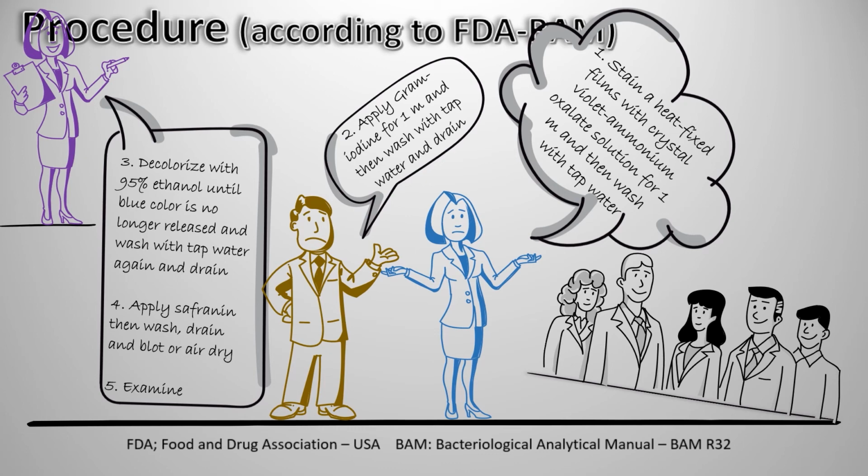And after that, just decolorize with 95% ethanol until the blue color no longer appears, and then wash it with tap water again and drain. Lastly, you just apply safranin for around 30 seconds and drain, and also blot or leave it to air dry.